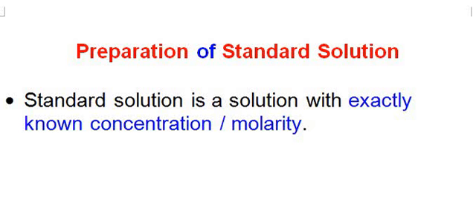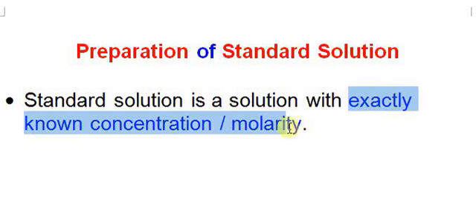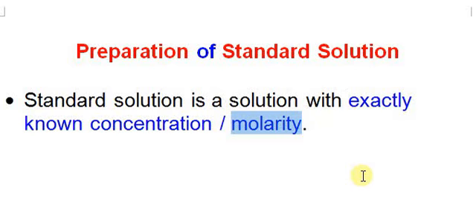This video is about preparations of standard solution. A standard solution is a solution with exactly known concentration or molarity. And in chemistry, we usually use molarity to describe the molar concentration of a solution.